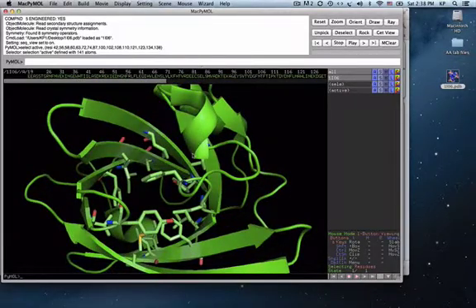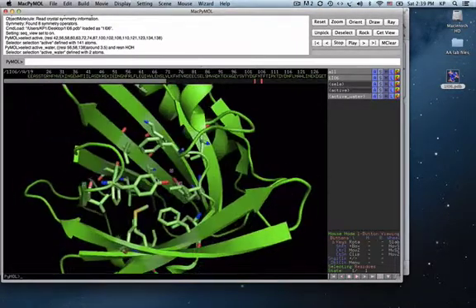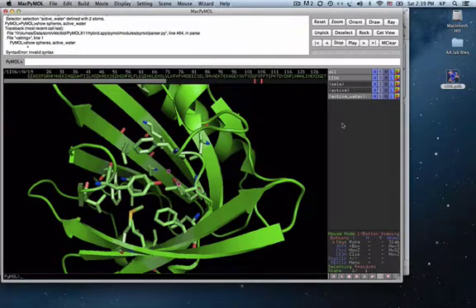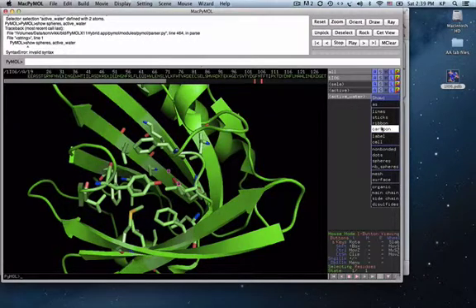Now I'm going to define the water molecules that are present in the active site. MUP has this important hydrogen bond network. So what I am saying is I know that residues 56, 58, and 138 all have water molecules near them. So I will do this, and now I can see the two water molecules that are associated with my hydrogen bonding network. I can show the spheres for my active water with a typed command, or I can do it right here.